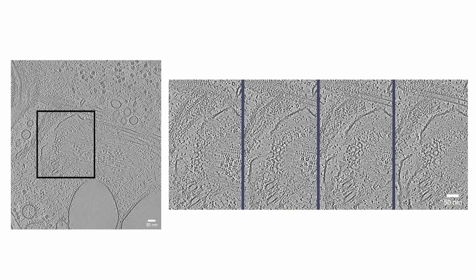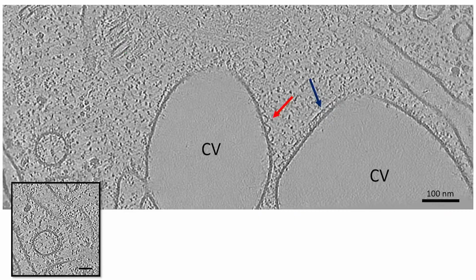We can see it here in the membrane of the flagella pocket. This is the region where the pocket starts to open, and we can see a lattice of clathrin here as well. And again, these coats on the surface of the contractile vacuole, this small wave-like one, and another type of coat here, and on this vesicle as well that is close to this structure. This may give a hint of another type of intracellular traffic that also plays a function in the contractile vacuole.